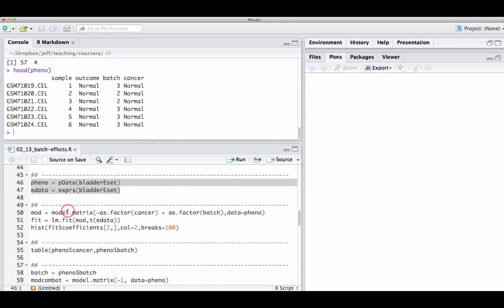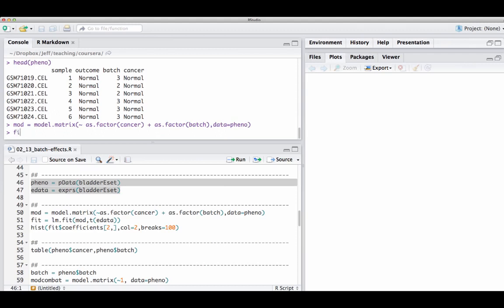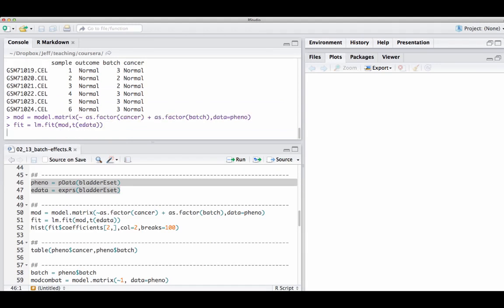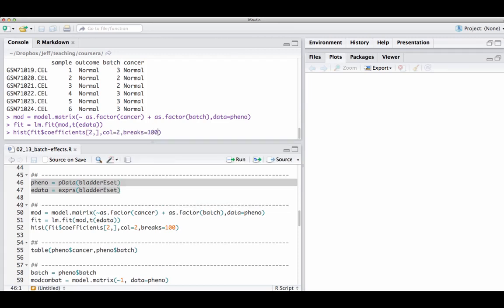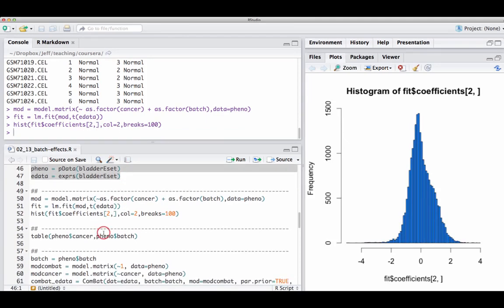The first thing you might want to do to deal with batch effects — if you actually have the batch variable labeled — is to directly adjust for it. You can do that by building a model matrix for the cancer variable and then adding in another term for the batch variable, specifying where the data comes from in the phenotype data. Now I've got this model matrix, which I can fit with lm.fit, as we learned in the last lecture. Now I have coefficients that have been adjusted for batch effects.